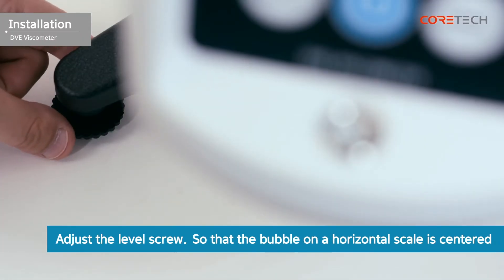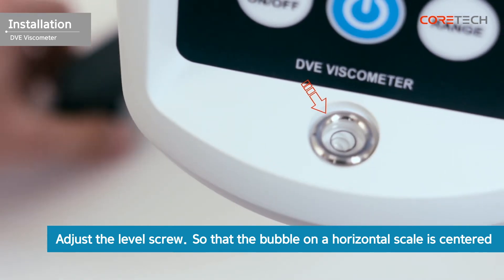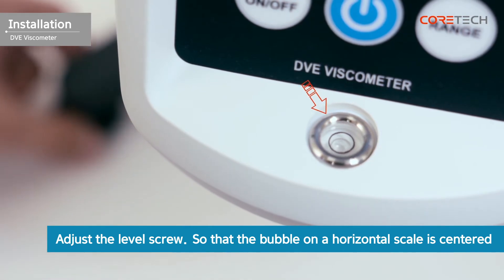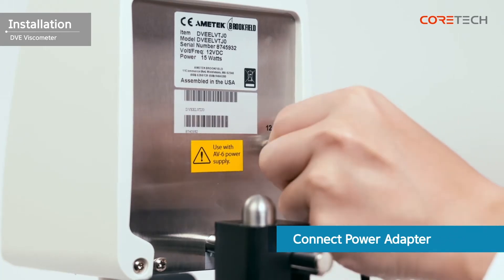Rotate the level screw at the bottom of the stand so that the bubble on the horizontal level is centered. The installation of the viscometer is complete.